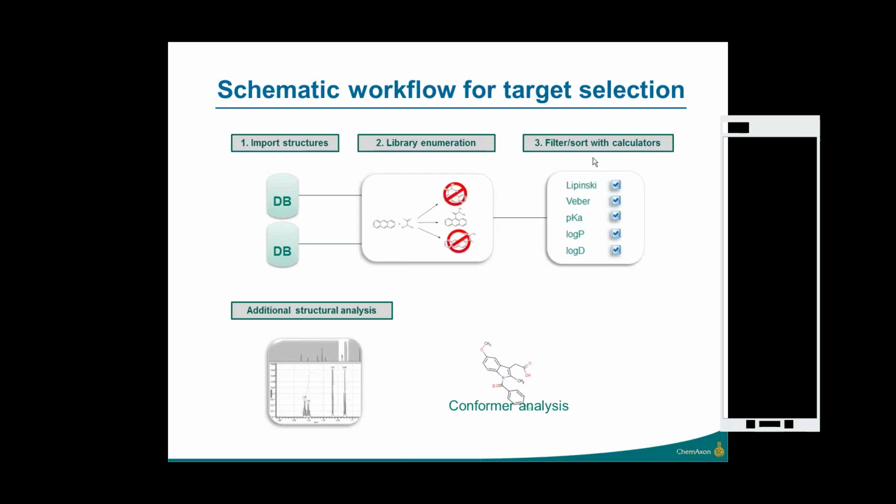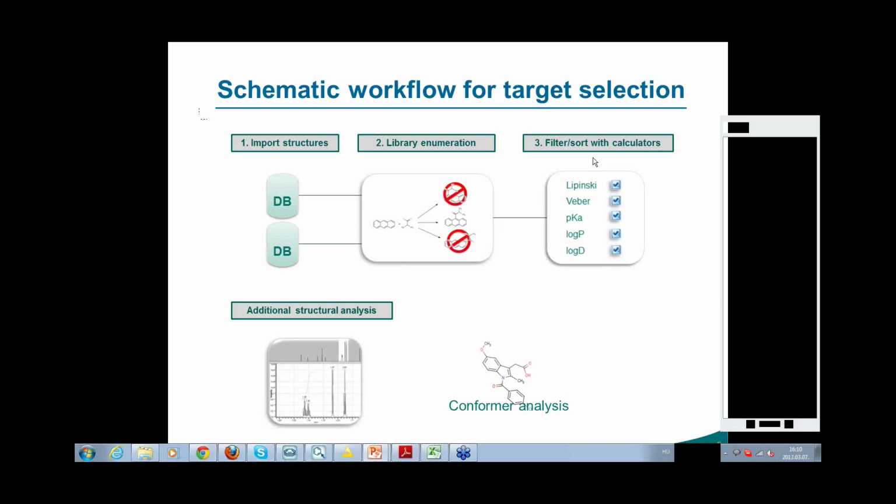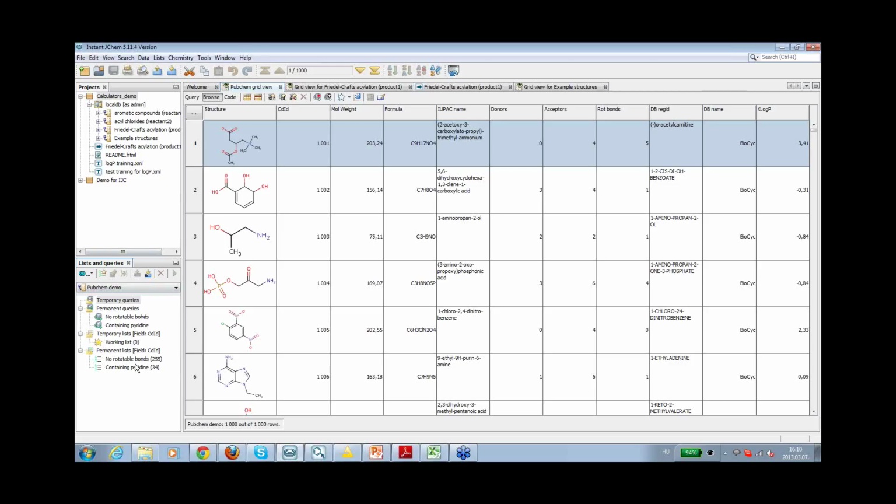This is the interface of our powerful data management tool. On the left hand panel, you can see the data tree where you can store and review your data. Below this panel, you can see your queries and manage them. And more importantly, in the middle, there is the actual data table listed with chemical and non-chemical information. There are several Java-based properties integrated in Instant JChem, which will provide additional chemical functions.